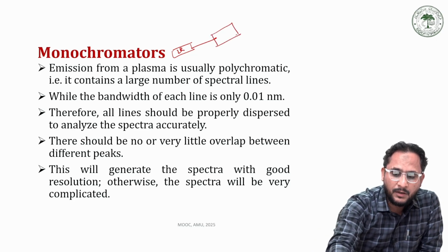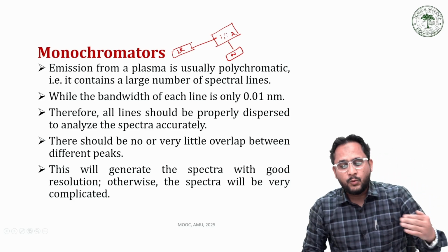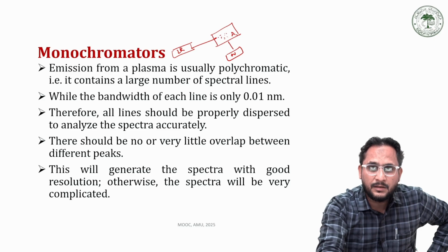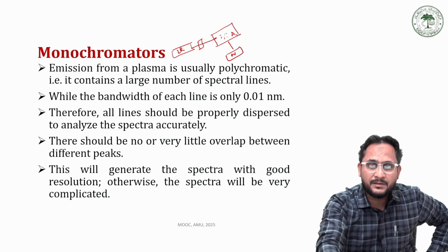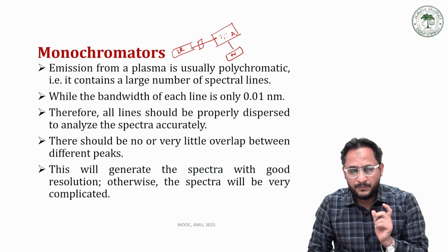Then we have an atomizer which is connected to a nebulizer. So this is our nebulizer, and we have the atomizer over here. Here the sample is injected from the nebulizer and converted into aerosol, where it interacts with light. So before this atomizer, we use a monochromator over here, so that we can select a particular wavelength of light in which we want to make the study.